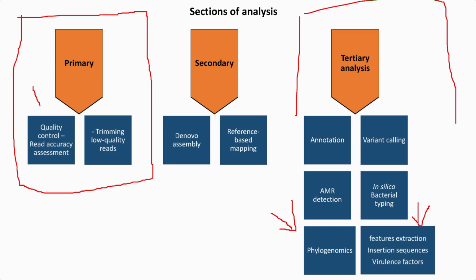In the case of variant calling, we can also find out if there's a mutation in a particular gene that's causing a different protein or a dysfunctional protein.